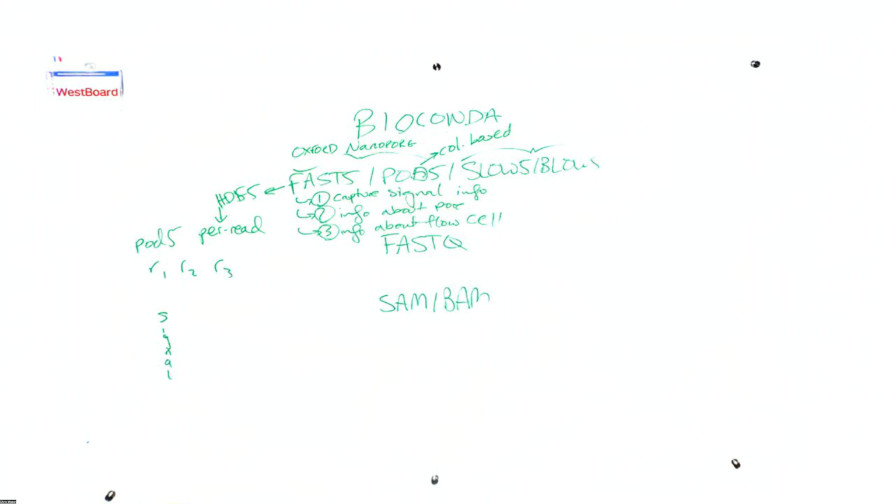So I will go through. The first, as you saw in homework 1, there was an example SLOW5 file that had a single read in it. And hopefully, looking at that, you got a little bit of an intuition for how it was organized. The first 59, 60 lines are just metadata. They contain all of the information related to the specific flow cell of interest. And then each line is basically the information about the read. So you can see that the first column, for example, gives you information about the read identifier. So that's a unique ID assigned by the actual sequencer.